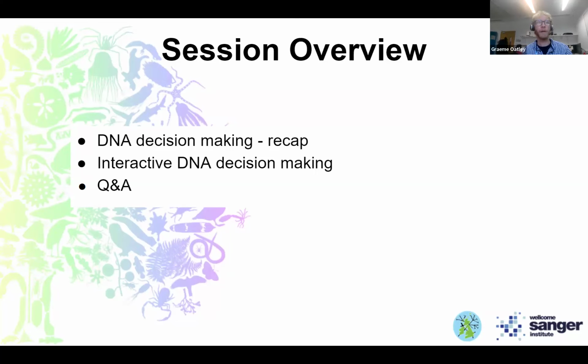So on Monday, I briefly talked about our DNA decision-making process. I'll go into slightly more depth on that this morning and have a bit of a recap for everyone. And then we'll be doing together an interactive DNA decision-making exercise.